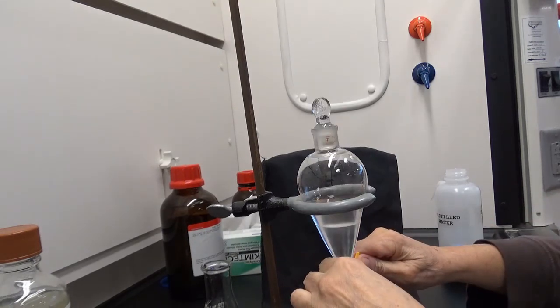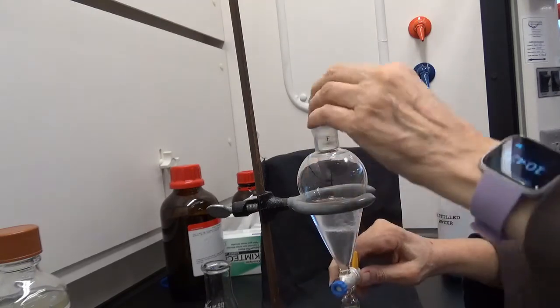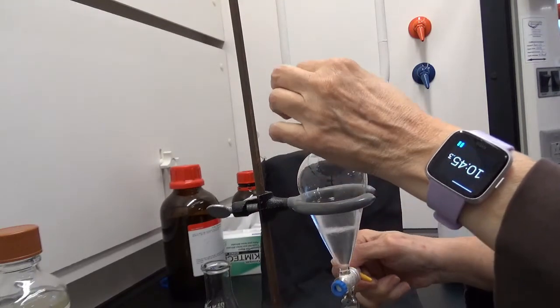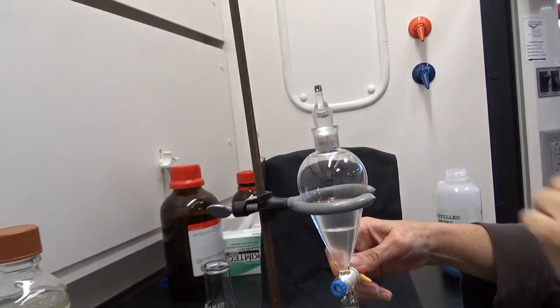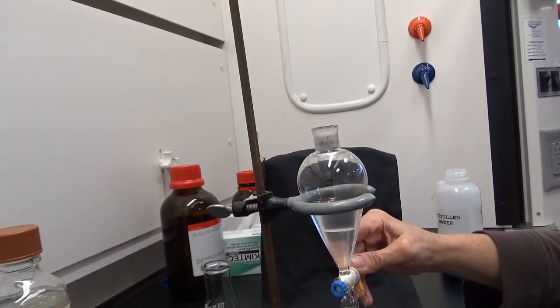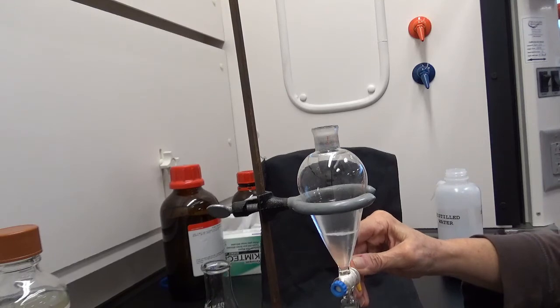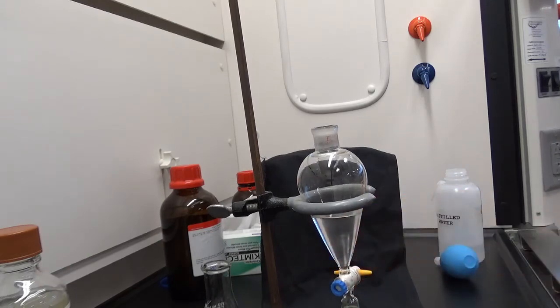Okay, there goes the lower layer. It's coming out. Oh, I have to take this cap off here. Did it. That's the lower layer.